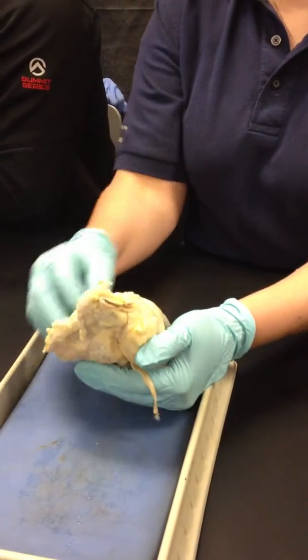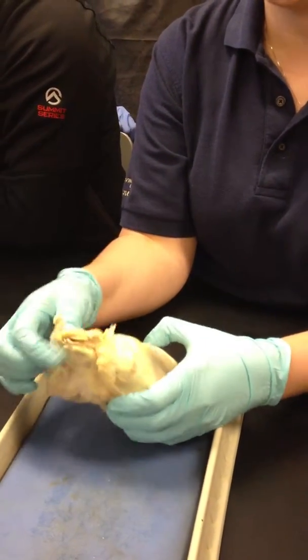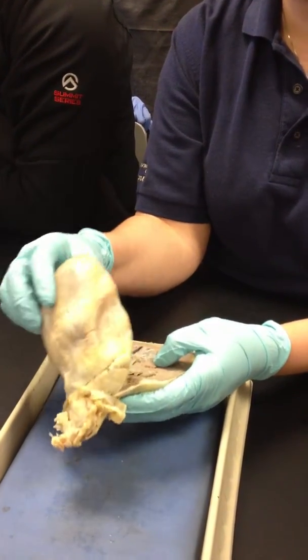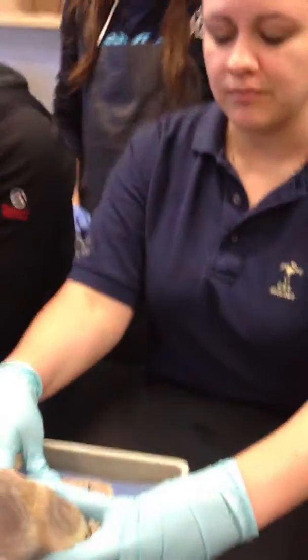And these are going to be your auricles here. So here's your left auricle, here is the right auricle. Make sure you can identify those. The easiest way to identify these up in the top is to just stick your fingers randomly into the different passages from the ventricles and from the atrium.